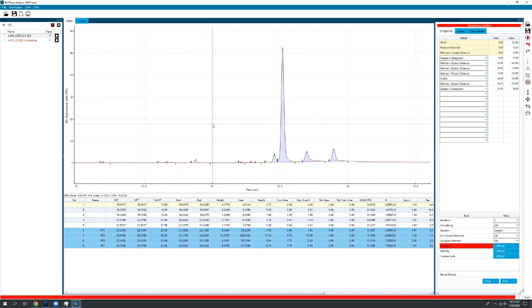So in under an hour, you can look at, say, 4 different heating times, 4 different heating temperatures. You can look at different concentrations of SDS. You can look at different sample prep workflows, whether you're doing one heat step or 2, whether you're adding that fluorescent dye separately, or adding it at the beginning in more of a reaction mixture.